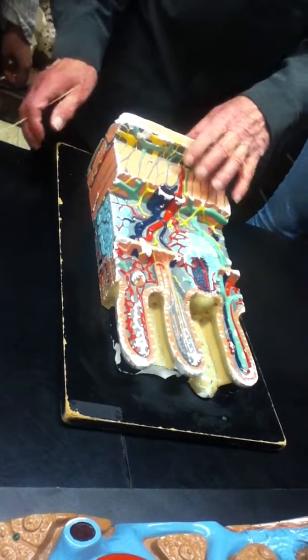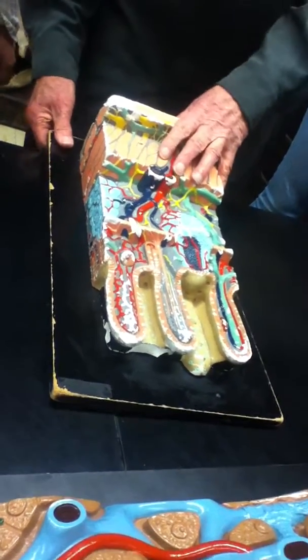This other blue cell here is not a lymphatic cell. This is called Brunner, B-R-U-N-N-E-R, Brunner's gland. Brunner's gland secretes a lot of mucus. It secretes stuff that neutralizes the acid, bicarbonate and stuff like that. So anyway, we just refer to it as Brunner's gland. I won't ask you for its function. Brunner's gland, B-R-U-N-N-E-R.